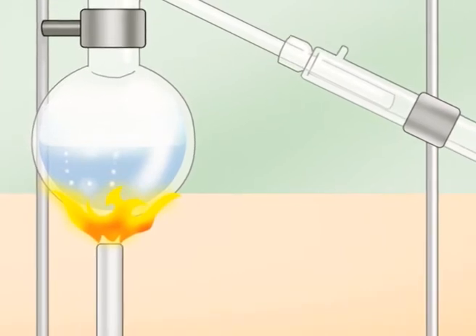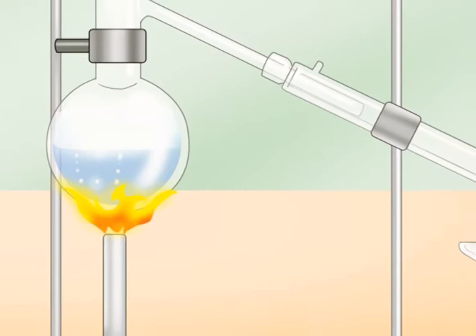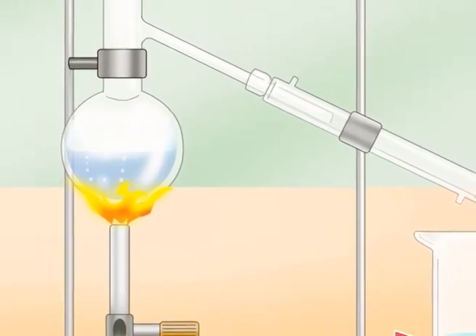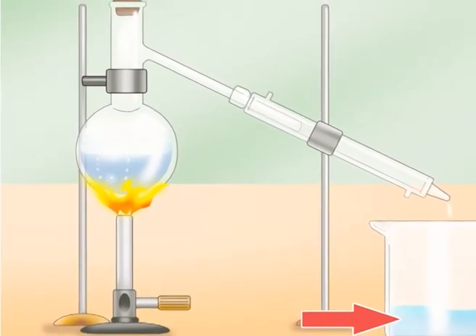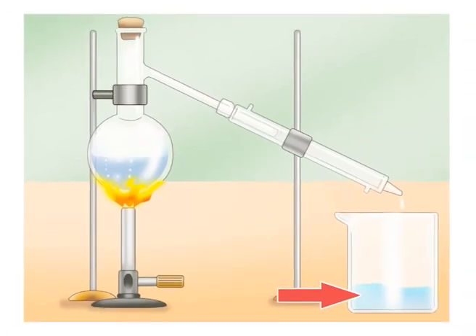So, in brief, distillation is a process of many steps, yet it is simple to treat and conduct. It comprises of heating the liquid sample to its boiling point, where the vapors will form, and then these vapors are transferred into the different part of the apparatus, where condensing of vapors takes place and then it is collected into a container.